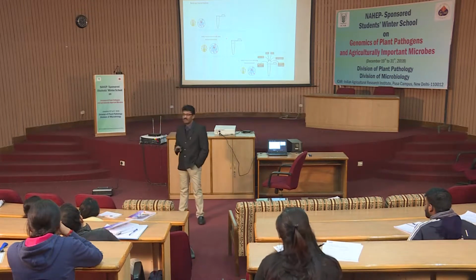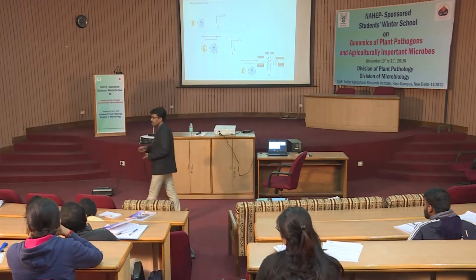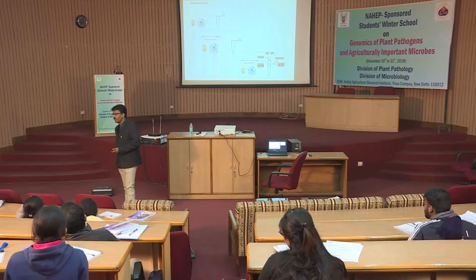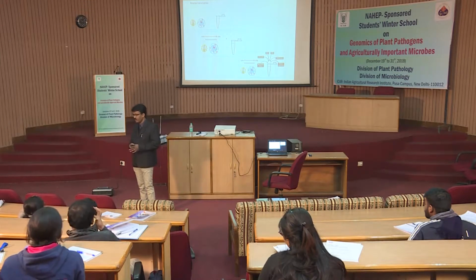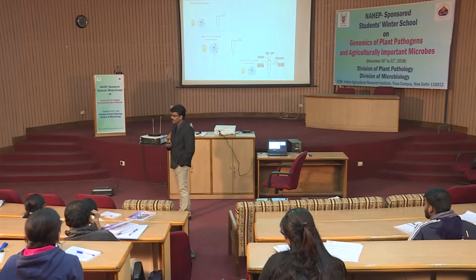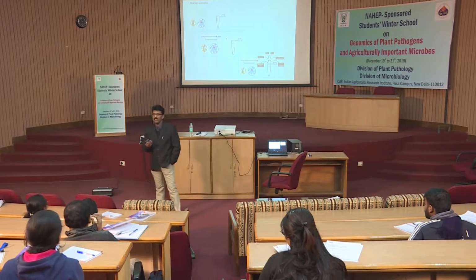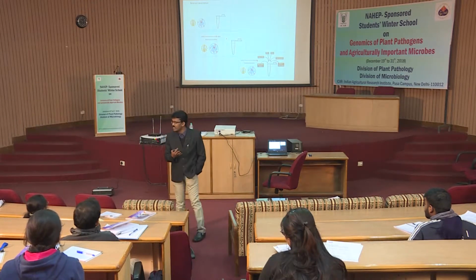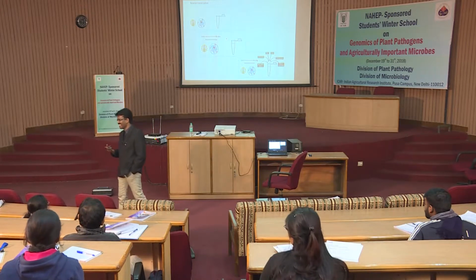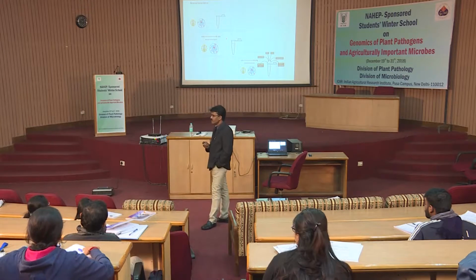Okay. So, sir, in one reaction, one probe only, since two strands are there, only to the specific one it will bind, to the single strand. Yeah. So for every event, only 50% of the fluorescence will we get. Doesn't matter, because at the end of the day, you want the free fluorophore in the PCR mix. That's the only thing. But when we do the quantification, we have to double the amount.